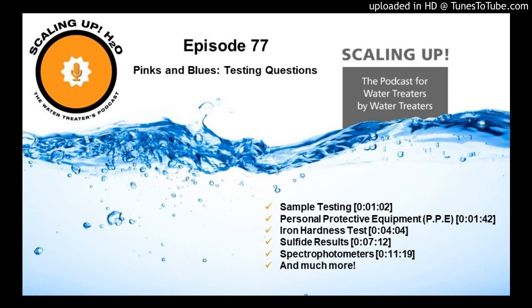But in this specific technique, what you're doing is you're adding 1 drop of EDTA before you do anything else. And you're going to count that drop later. So when you start your testing, if you put 1 drop in, you're going to start at 2 drops. But what that does, that starts to bind up any of those metals or whatever the interferer is, which in this case it's iron, in that test. So it's not going to interfere when we're going after the calcium.